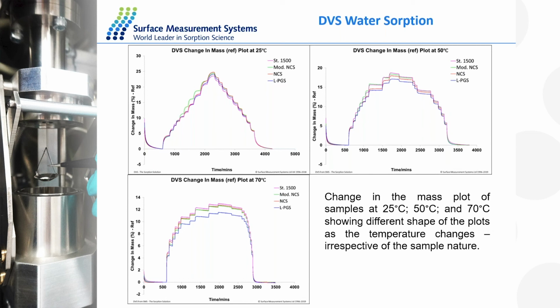Okay, a follow-up question from Ilham. Have you considered any RH above 50%? So in the experiments we've done, from 0% to 95% RH, we have gone above 50% in this case.